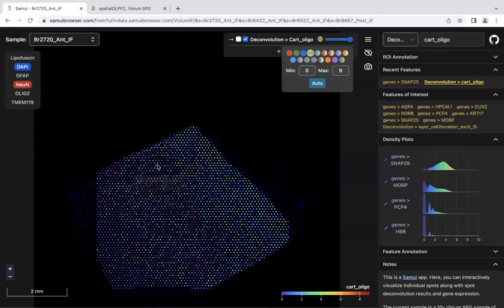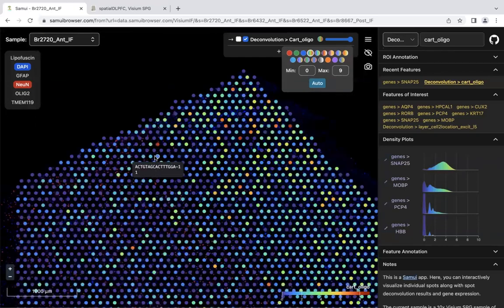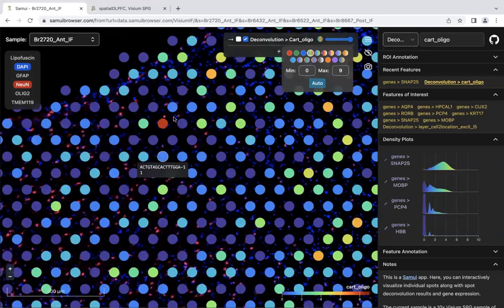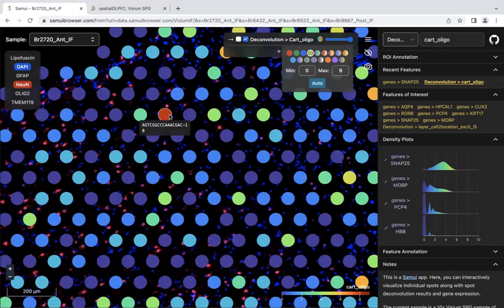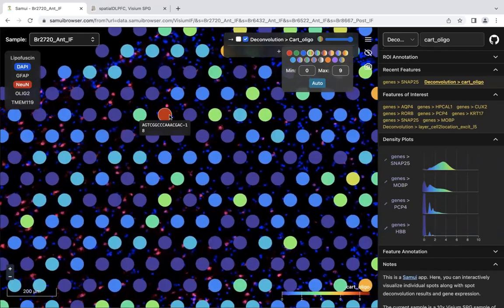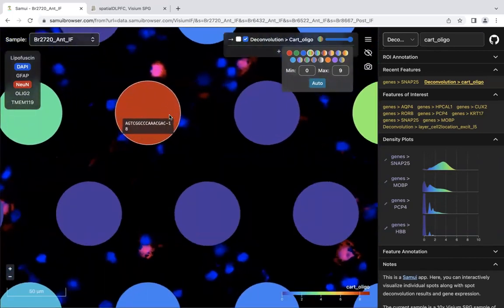Another unique aspect of this app is that you can look for points that have very high counts. This supposedly has eight oligodendrocytes, right? So it's a little abnormal. Let's take a look in here.